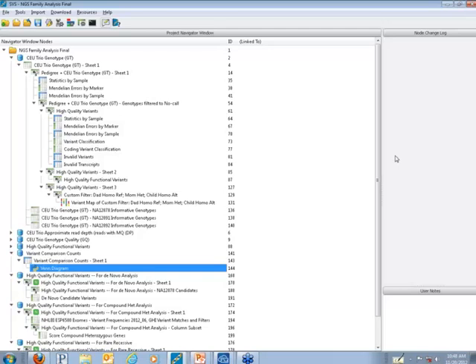Is Genome Browse really free? Will it cost in the future? Yes, it is really free, and no, it will never cost. You'll never be charged for it in the future. We may have additional applications that are optional that can be added onto it that there might be a charge applied to. We will continue to develop and add new features to Genome Browse, and it will continue to be free for all time.